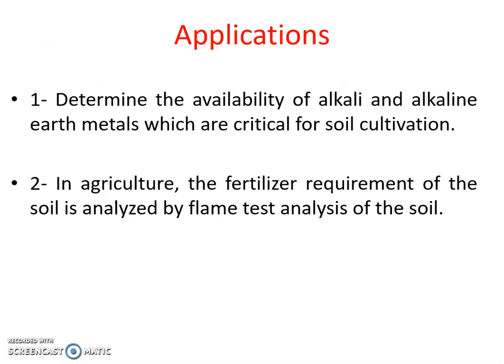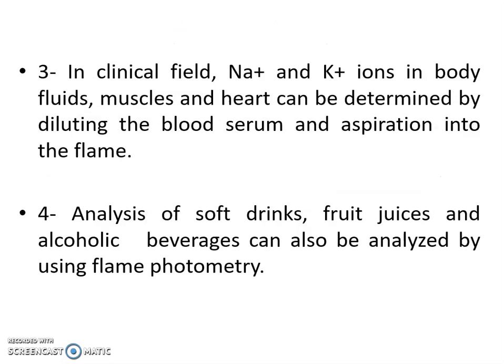Now applications. Determine the availability of alkali and alkaline earth metals, which are critical for soil cultivation. In agriculture, the fertilizer requirement of the soil is analyzed by flame test analysis of the soil. In the clinical field, sodium and potassium ions in body fluids, muscles and heart can be determined by diluting the blood serum and aspirating into the flame. Soft drinks, fruit juices and alcoholic beverages can also be analyzed using a flame photometer.